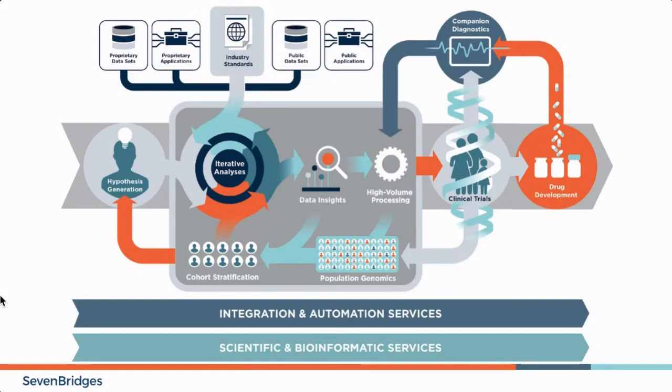So basically, we co-localize the access to data, whether it's public data sets or bringing in your own private data, the tools and workflows needed to do the analysis. And again, we have many publicly available tools on the platform, or we offer the flexibility to bring in any of your own tools. And combining this with the scale and flexibility and speed of cloud computing. And these three things together really give us the ability to do very high volume processing very quickly and easily. So that scalability to deal with very, very large data sets, very, very complex analyses.